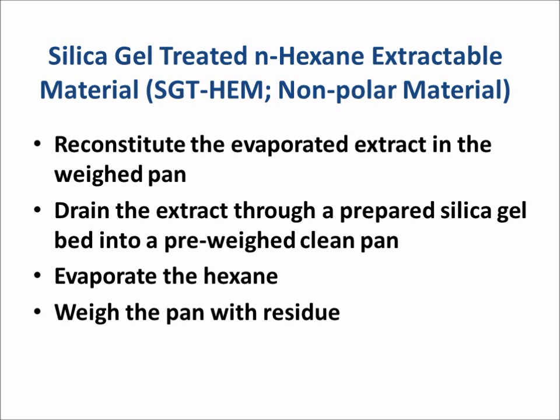First, you will reconstitute the evaporated extract in the weighed pan. You'll drain the extract through a prepared silica gel bed into a pre-weighed clean pan. You'll evaporate the hexane as you did before and you'll weigh the pan with the residue.